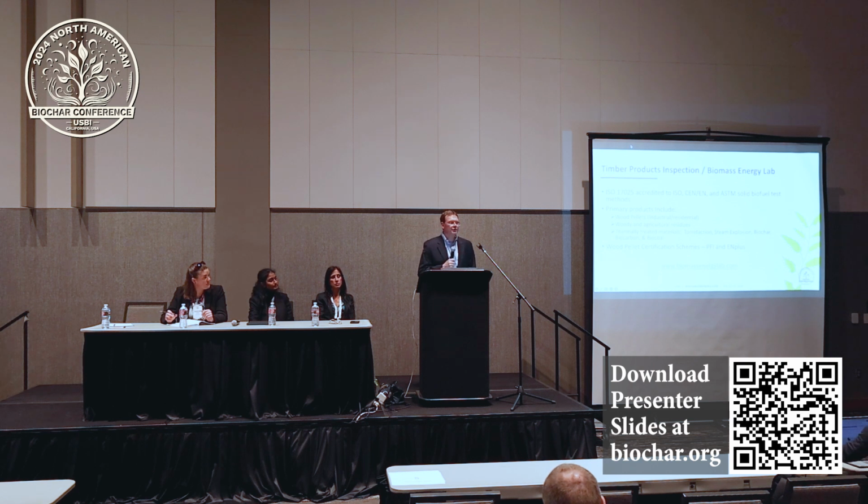And we do certifications of some of these products. Some examples for the wood pellet industry here in the United States. The Pellet Fuel Institute standards are essentially the residential domestic process. We're a certification body, inspection body, and testing body for that certification scheme. And then internationally, EN Plus is another wood pellet certification scheme. We act as an inspection body and as a testing laboratory.